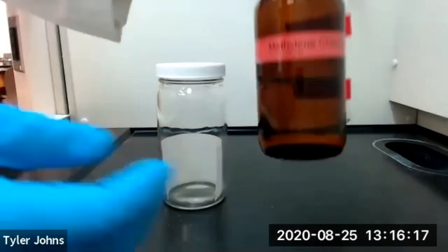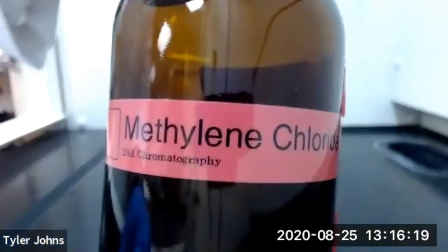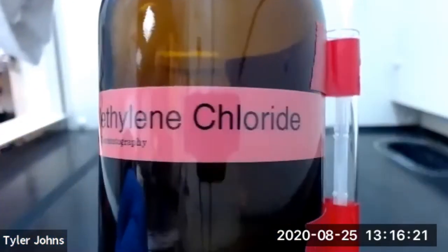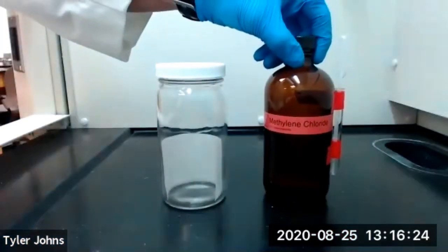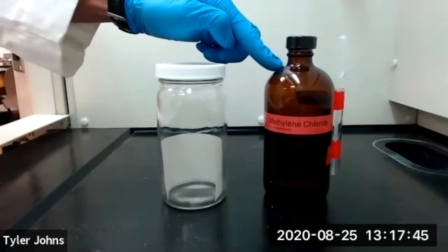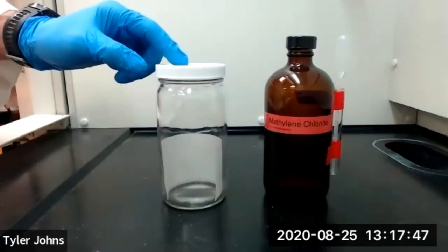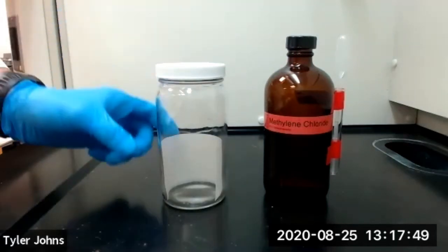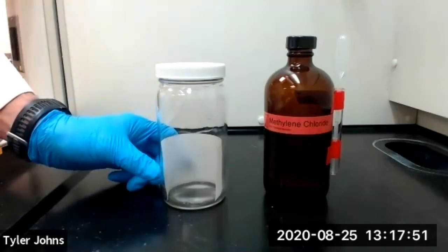The solvent that we will be using for this experiment is methylene chloride. We're going to transfer approximately 5 milliliters of methylene chloride to our development chamber while making sure to completely saturate our filter paper with the methylene chloride.